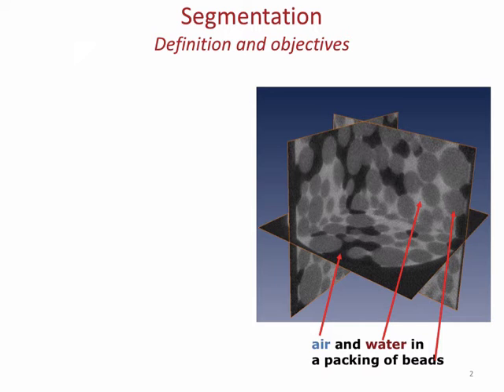Okay? And you can, in ImageJ, just in 2D images, do despeckle for some small stuff. But actually, this median filter on binary images works rather well for that purpose as well. So it's going to remove a lot of small speckled noise.